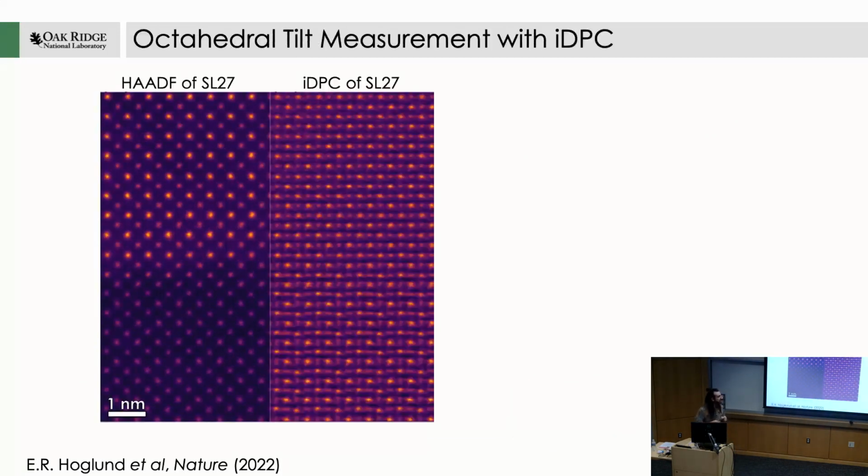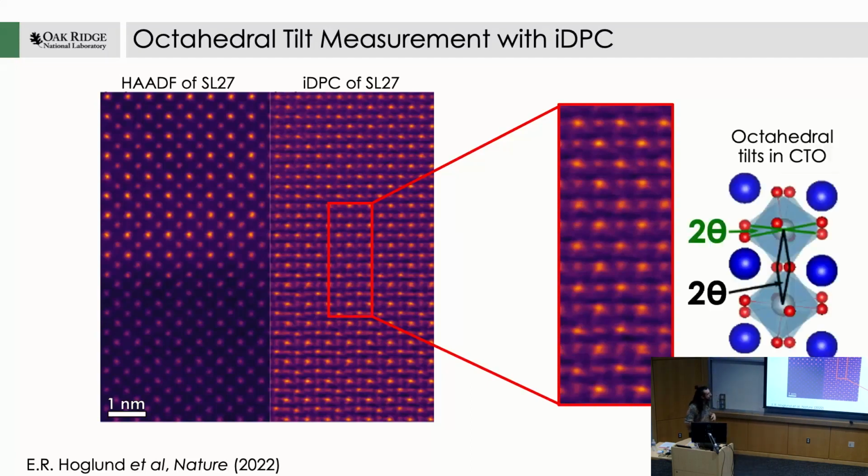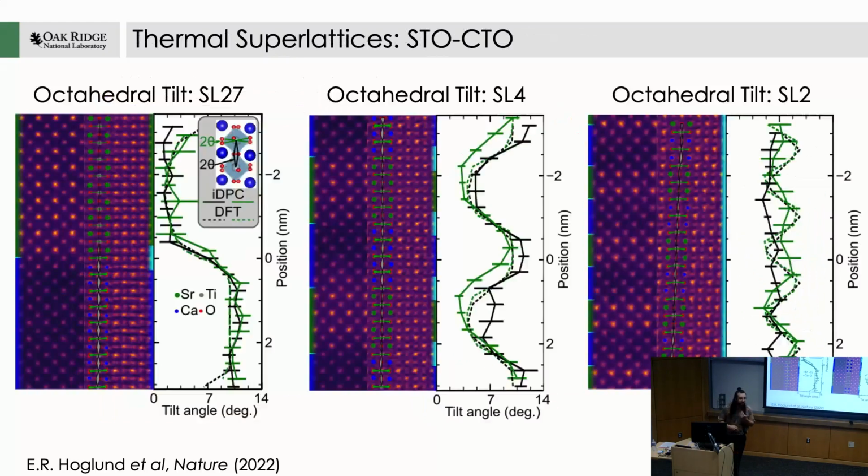And so he did these DPC measurements, which allows us to measure the octahedral tilts. You can see in STO, we see no octahedral tilts, but then in the CTO, we can actually see these oxygen atoms split. And that's because the titanium octahedra rotate, and then in projection, you have a splitting between the two oxygen atoms. And so we can just straight up measure this angle by measuring the distance between the two oxygen atoms in the DPC image. And he found the following for the different superlattices.